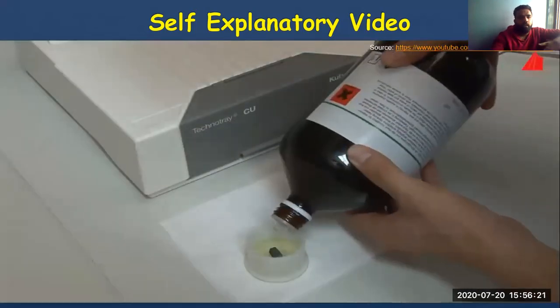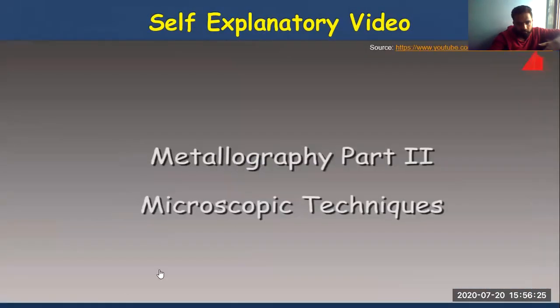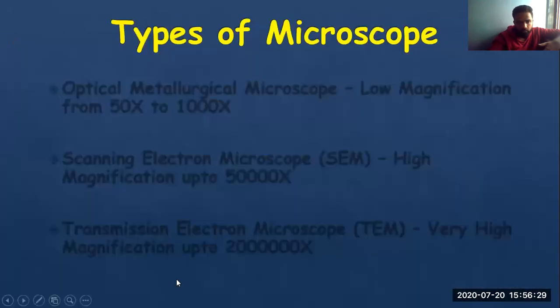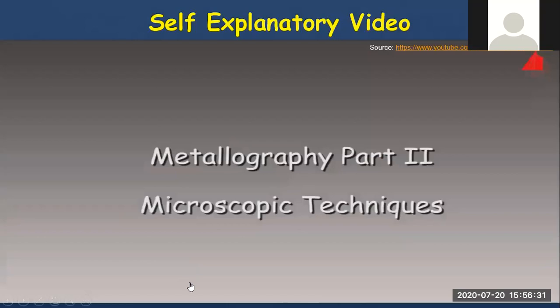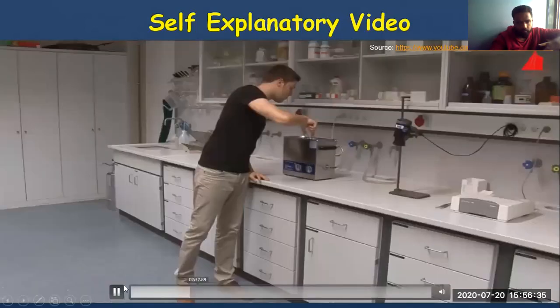A thin... 1 second. I hope you people are getting... Okay? 1 second. I hope you people are getting... Yeah? Adhere well to the specimen so the specimen is clean and dry.